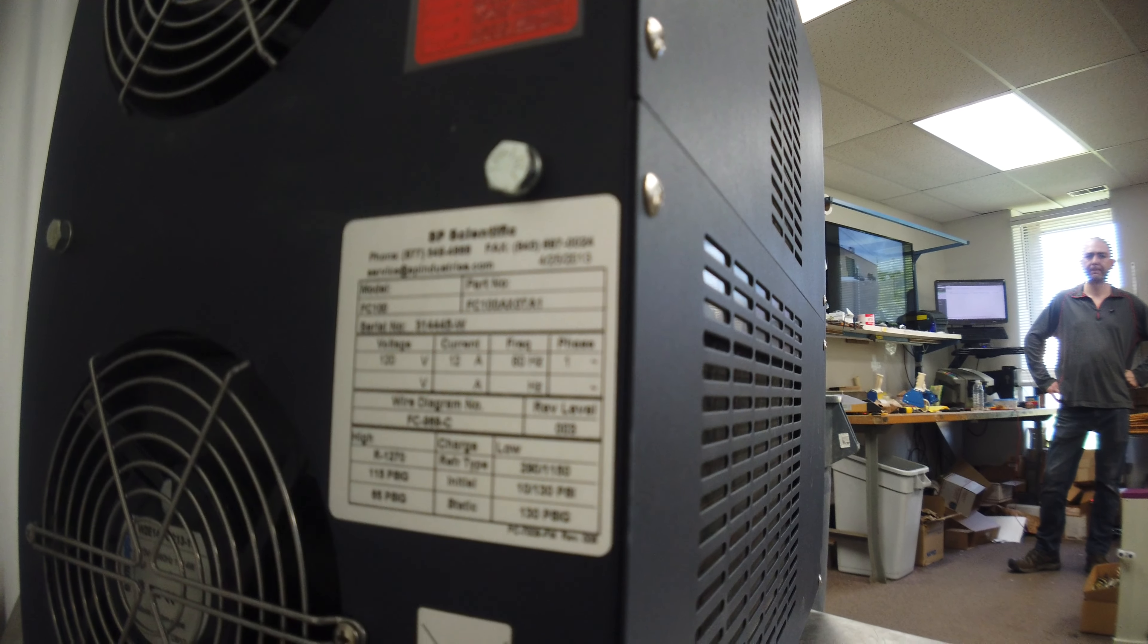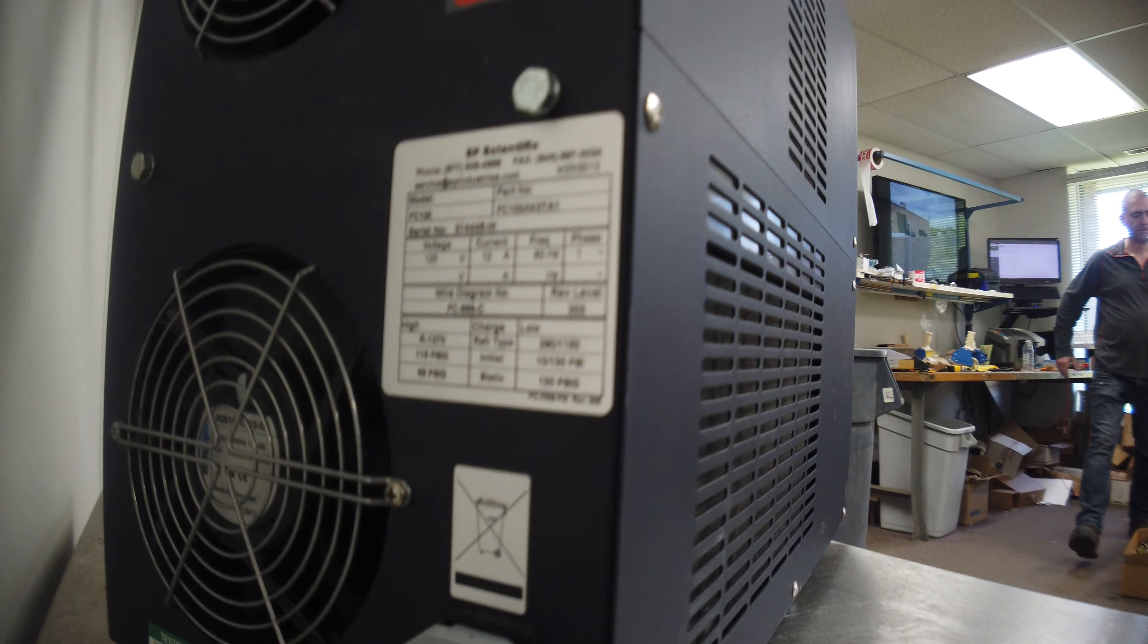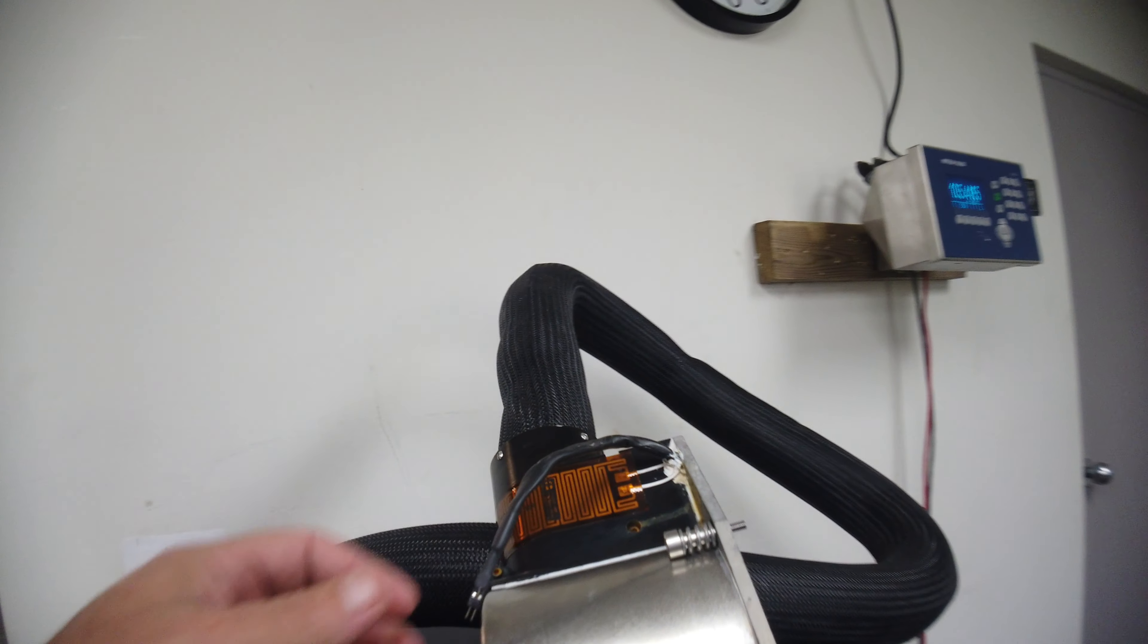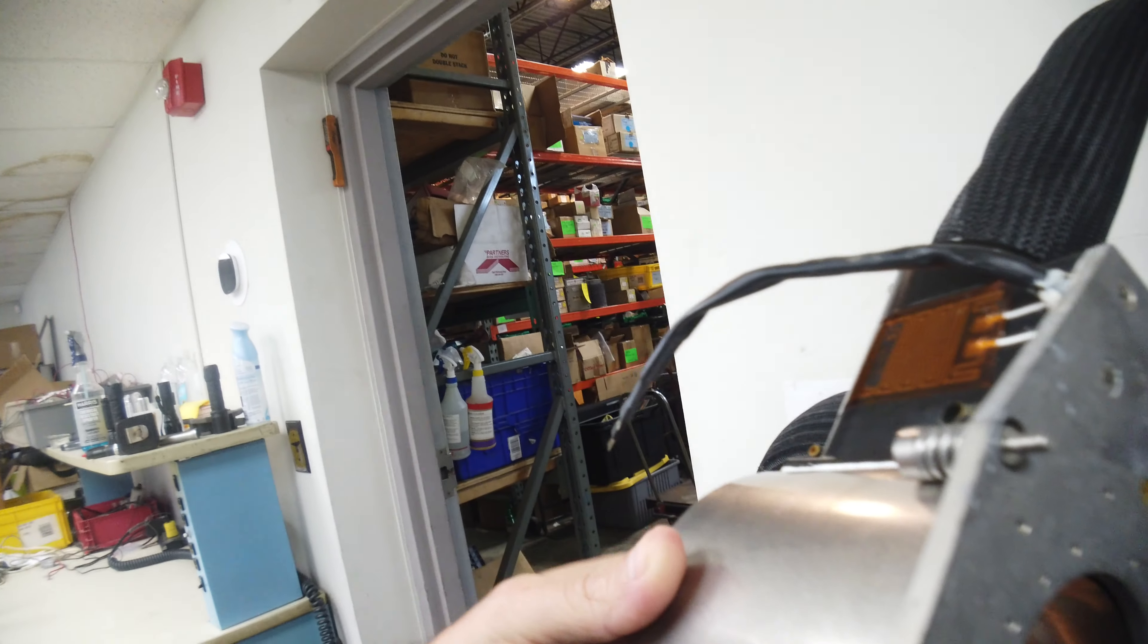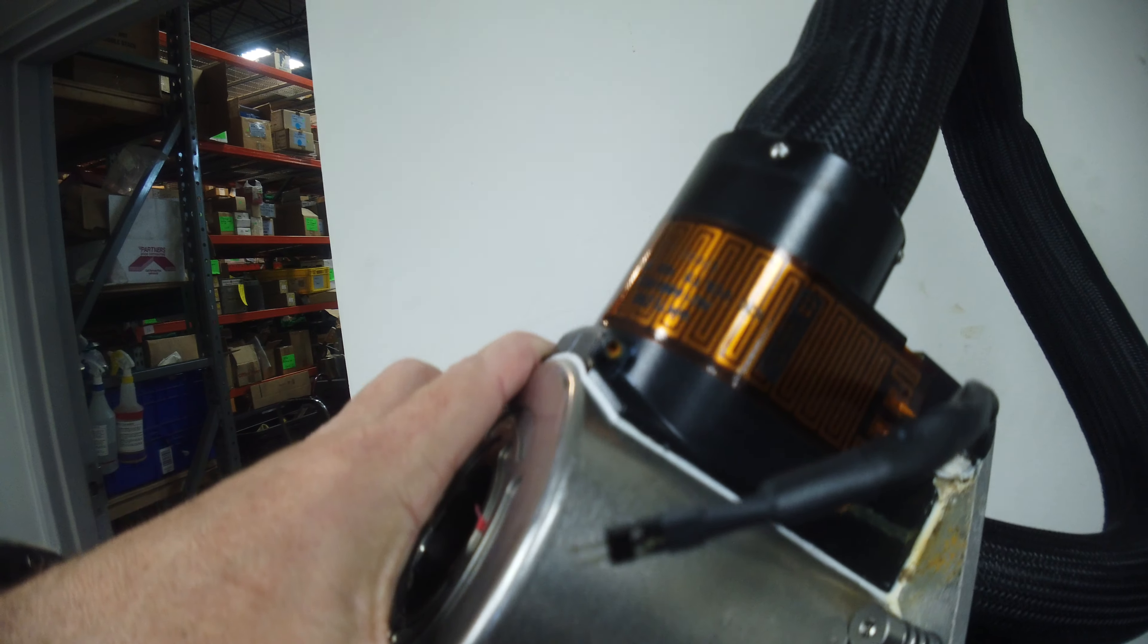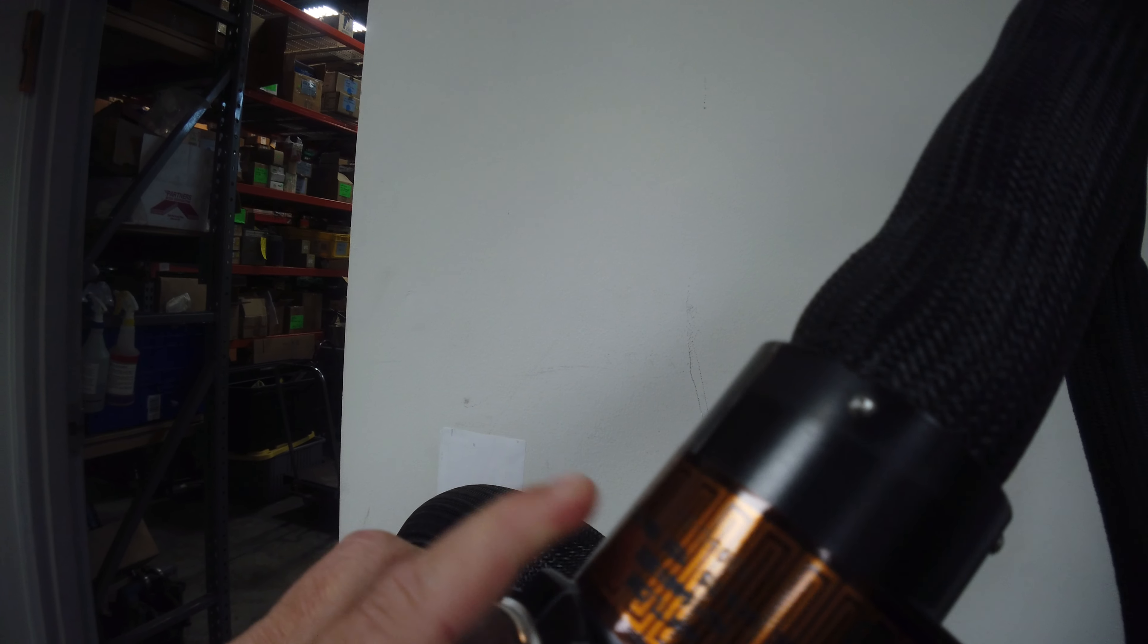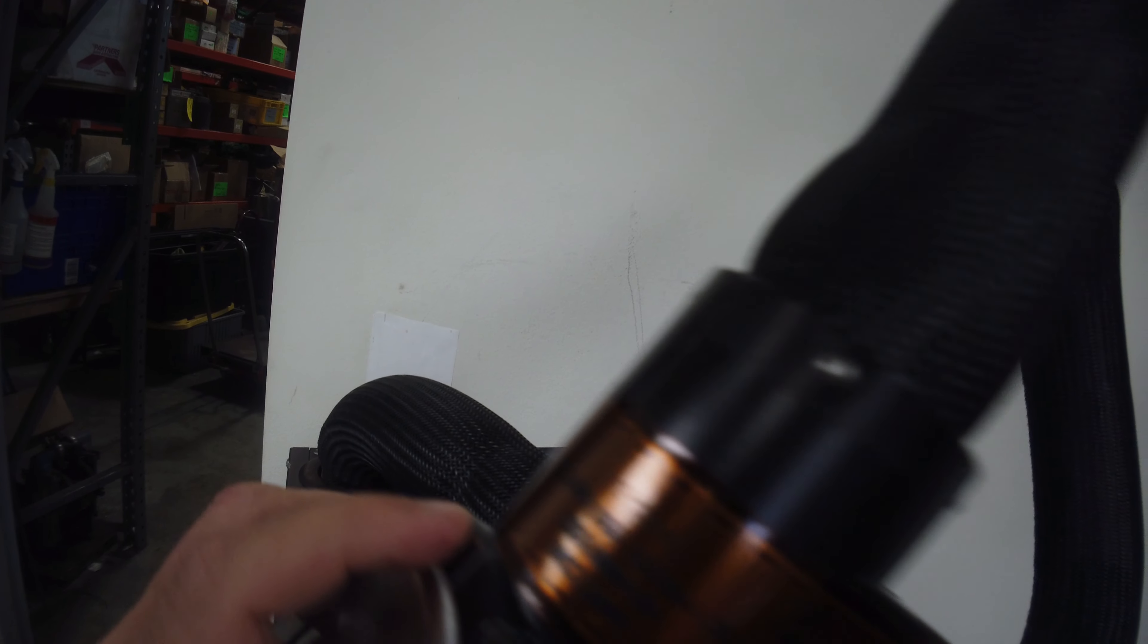This comes up as an immersion cooler. And you can see the head on this. The ones I see online aren't as extensive as this one. It's got this extra, maybe a sensor here or a heater. I'm not sure.